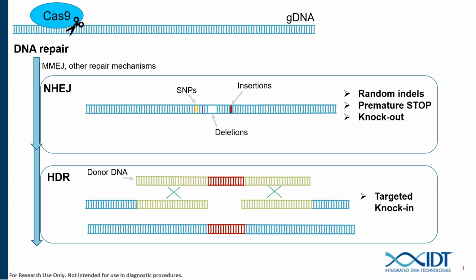So let's talk about basic principles of CRISPR. CRISPR's been around for about a decade. I'm sure plenty of people know at least a little bit about it, but I want to point out some key components here, starting with the idea that CRISPR at its core is a method to target genomic DNA. So with a CRISPR-Cas9 nuclease, there's a targeted intended double-strand break. And the interesting part of CRISPR really comes in the repair of that double-strand break. And that's where different reagents can impact the repair outcome.